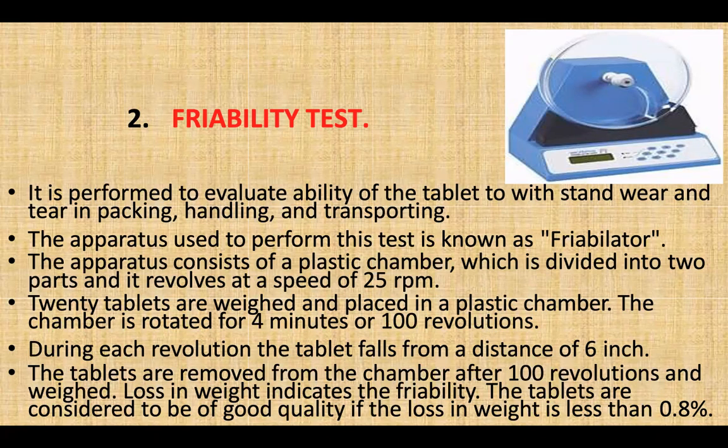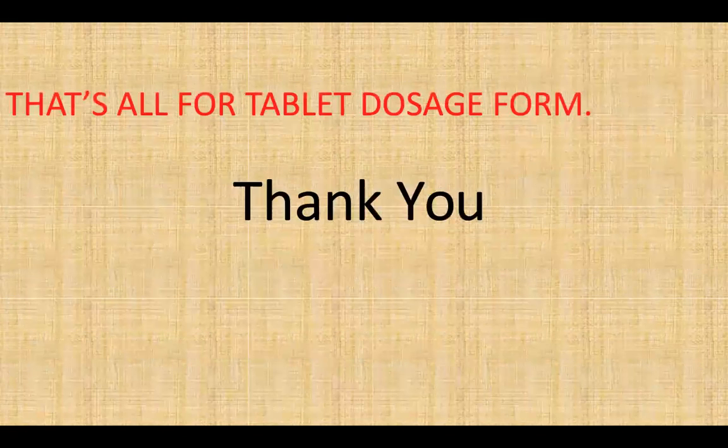The tablets are removed from the chamber after 100 revolutions and weighed. Loss in weight indicates the friability. The tablets are considered to be of good quality if the loss in weight is less than 0.8 percent. So that's all for tablet dosage form.